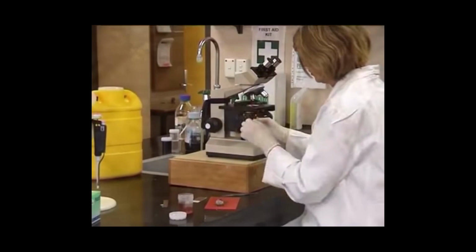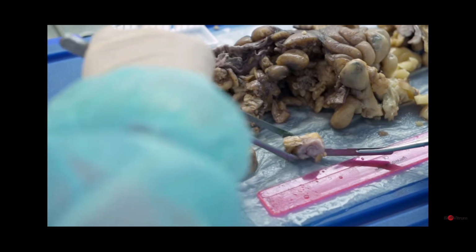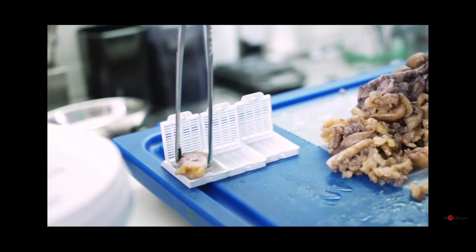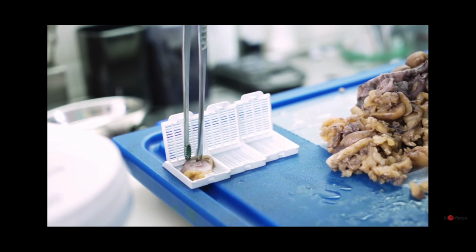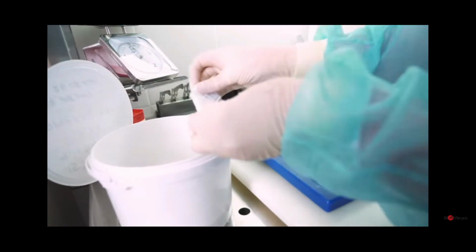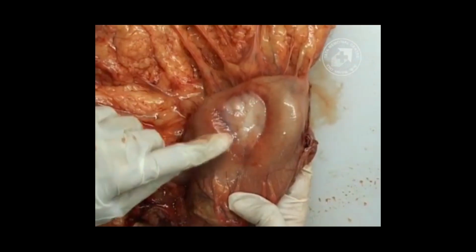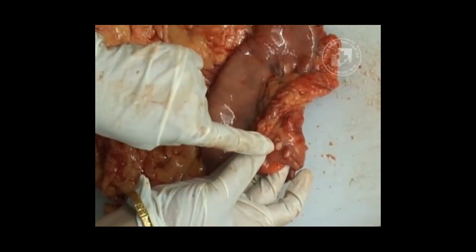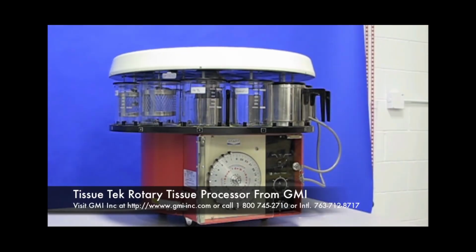When the histotechnologist is back later that morning, grossing is then done. But there are also instances when the histotechnologists are available and there are no other specimens that need to be processed, then grossing comes first before fixation and then the tissue is placed into the autotechnicon for processing.